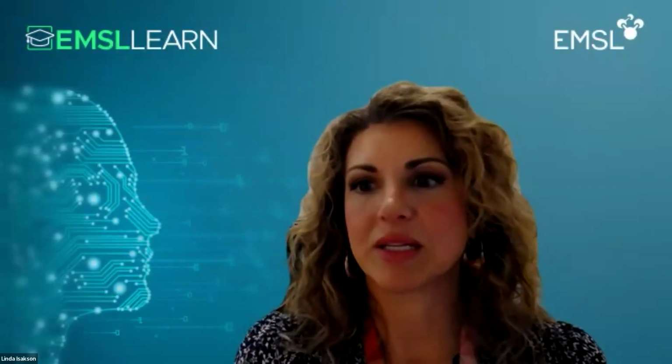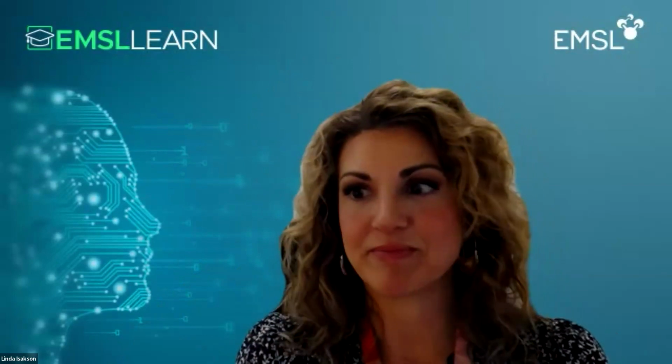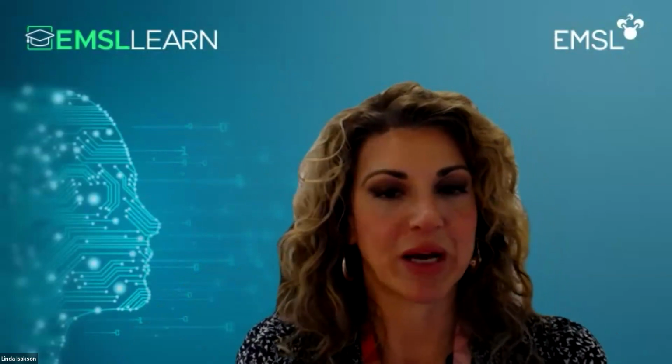All right, next question. How can I create a RhizoChip? You talked about micromodels. Yeah, so I can answer this one. Really, a micromodel is a RhizoChip. It's just a very scalable RhizoChip.